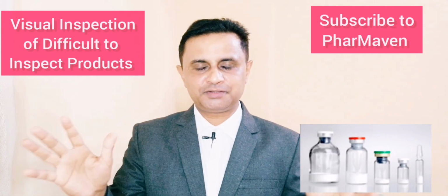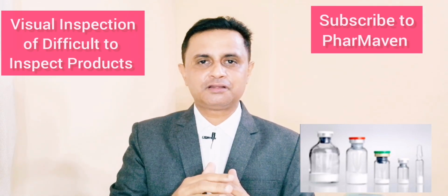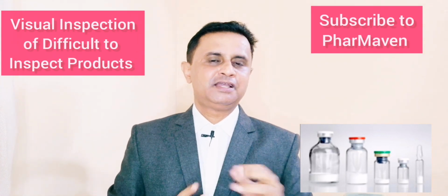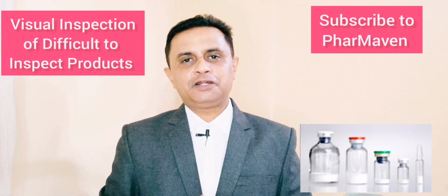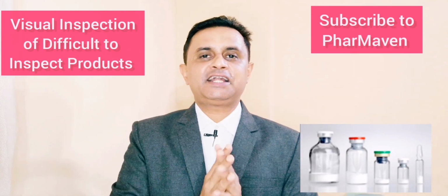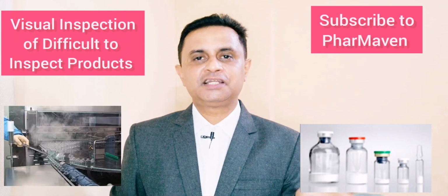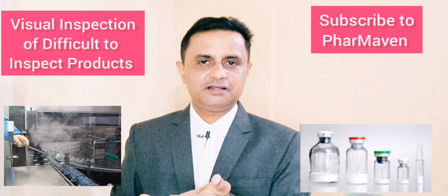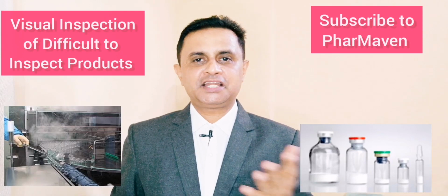First is general inspection as usual for all cosmetic defects, all the problems visible on the outside surface of the cake, as well as reconstituting a certain number of vials. Also, what we can do immediately when a vial is getting filled, we can collect certain filled vials still in liquid state and inspect those containers for any particulate rejections. This should be done online when the batch is getting filled.